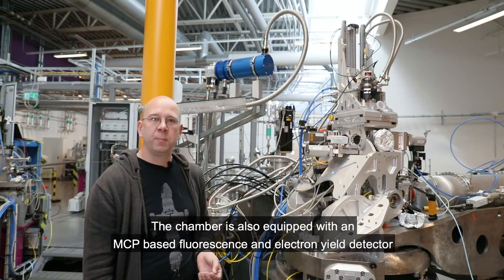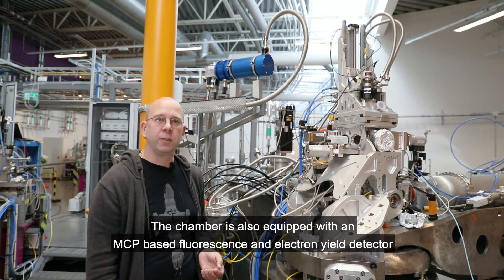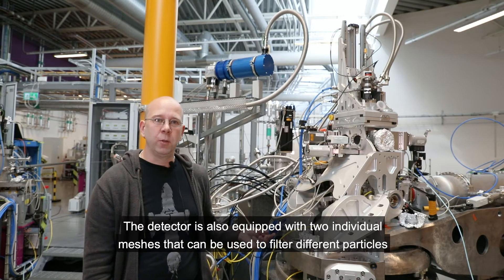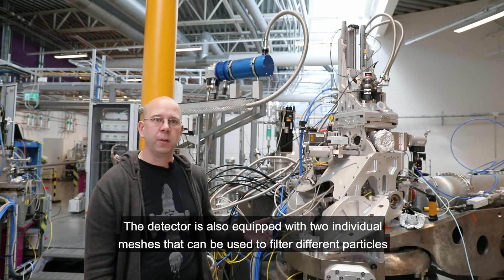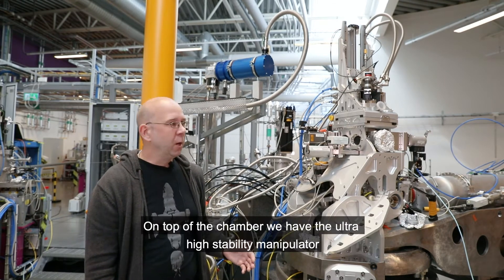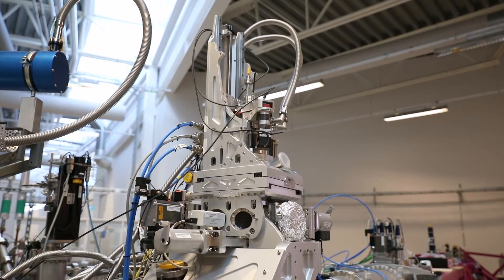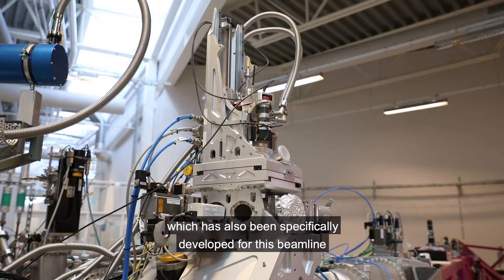The chamber is also equipped with an MCP-based fluorescence and electron yield detector, which is equipped with two individual meshes that can be used to filter different particles. On top of the chamber we have the ultra-high stability manipulator, which has also been specifically developed for this beamline.